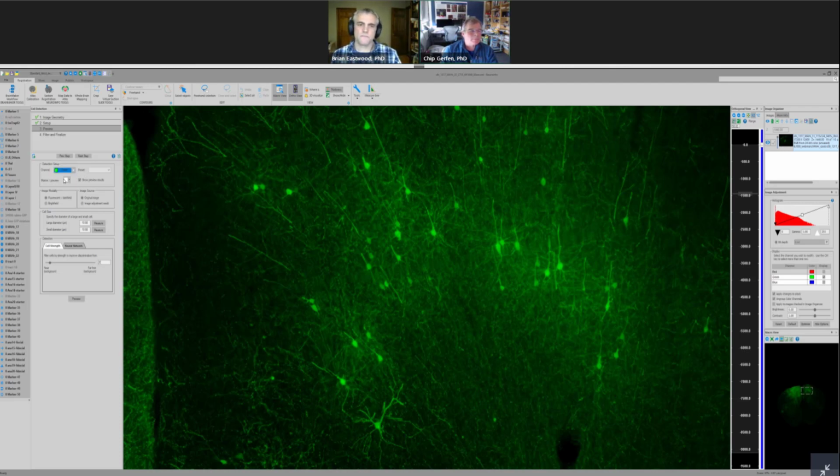Hey, Chip, I had a really relevant question here. Someone asked, just for a contextual point, what exactly are we looking at here? This isn't our c-fos case, right? No. I'm sorry, I went through that pretty fast.